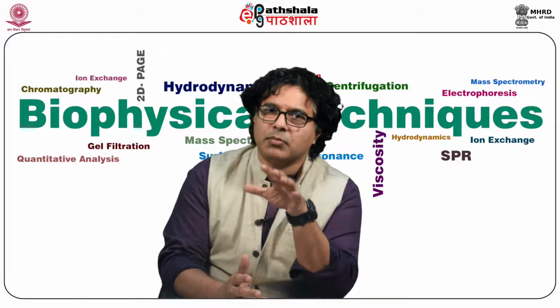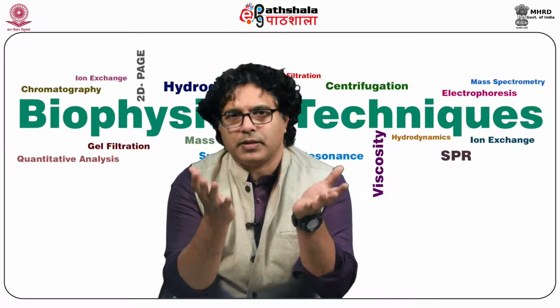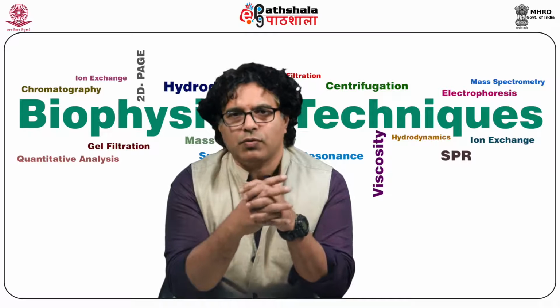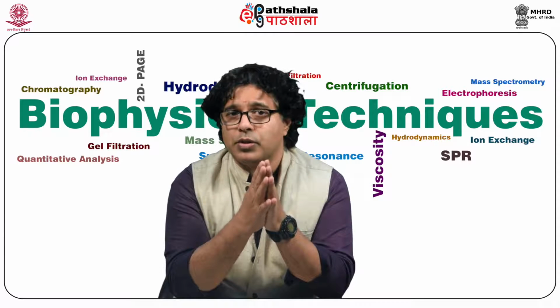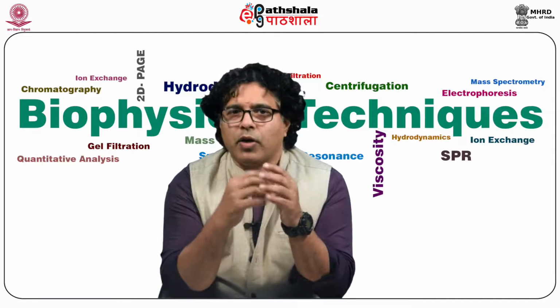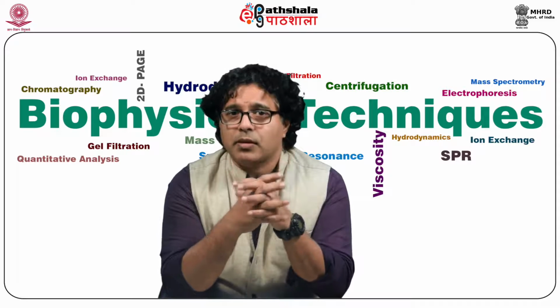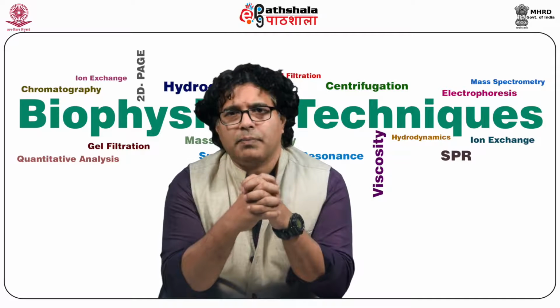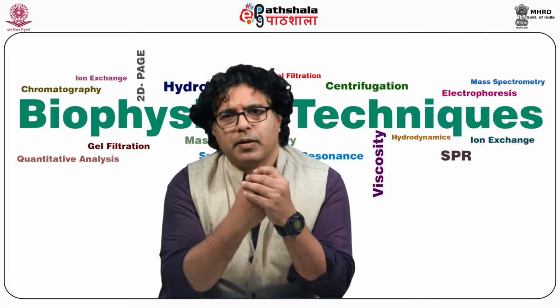Gas phase reactions in mass spectrometry are very important to understand what's happening inside this instrument. Mass spectrometry is an important structure information tool for chemists, and it is increasingly becoming an important tool for those in biological sciences, including those who are working in drug discovery, environmental toxicology, proteomics, biomarker analysis, metabolism studies, and even those who are working with newborn metabolism screening.